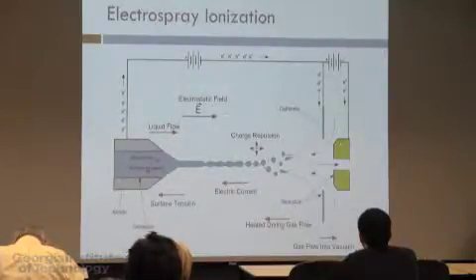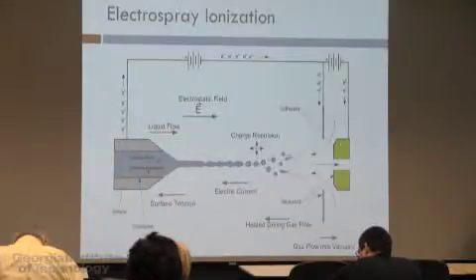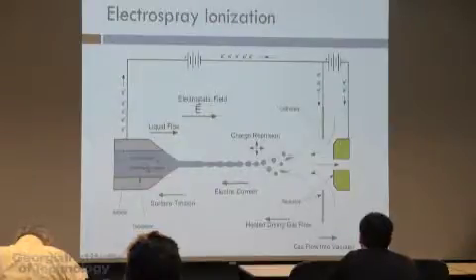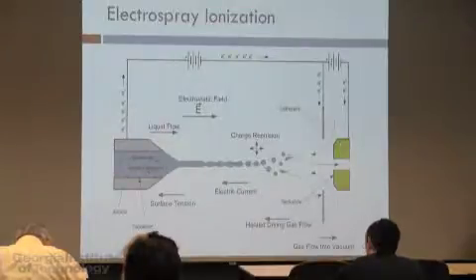So like I told you before, key to this process is the ability to take metabolites in the liquid phase and put them in the gas phase with a charge. Mass spectrometry works with ions, and we use a very cool technique called electrospray ionization. This was not invented for metabolomics. This was actually invented for painting cars, okay? So electrospray was invented for spraying paint on cars, but somebody very clever said, how about we use it to make ions? And it works.